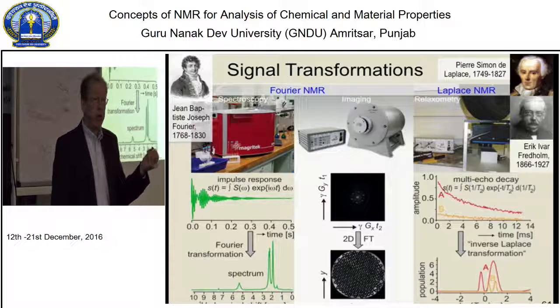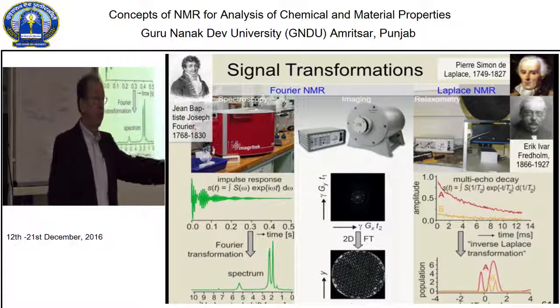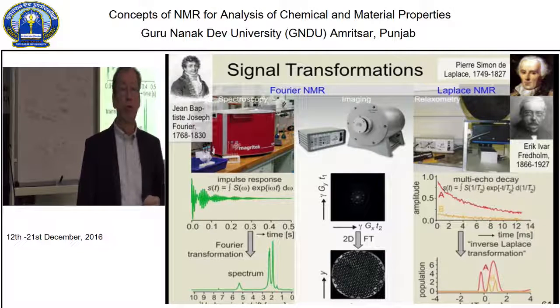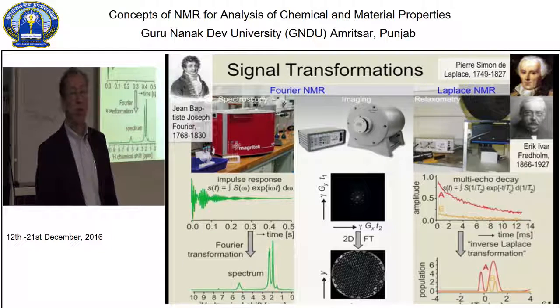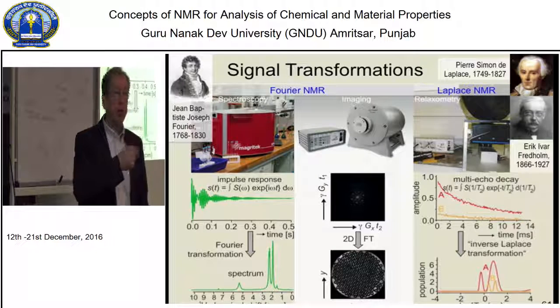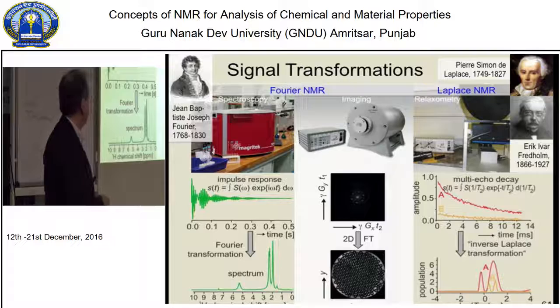What the chemistry community has been doing with two-dimensional NMR spectroscopy, people have come up with two-dimensional NMR maps that correlate the distribution of relaxation times T1, the distribution of relaxation times T2, and the distribution of diffusion coefficients in two-dimensional and three-dimensional maps that only address relaxation information and physics information of material. And we will mention that also as we go along, so you know the most recent approaches, and there's a tremendous wealth that is there in magnetic resonance.